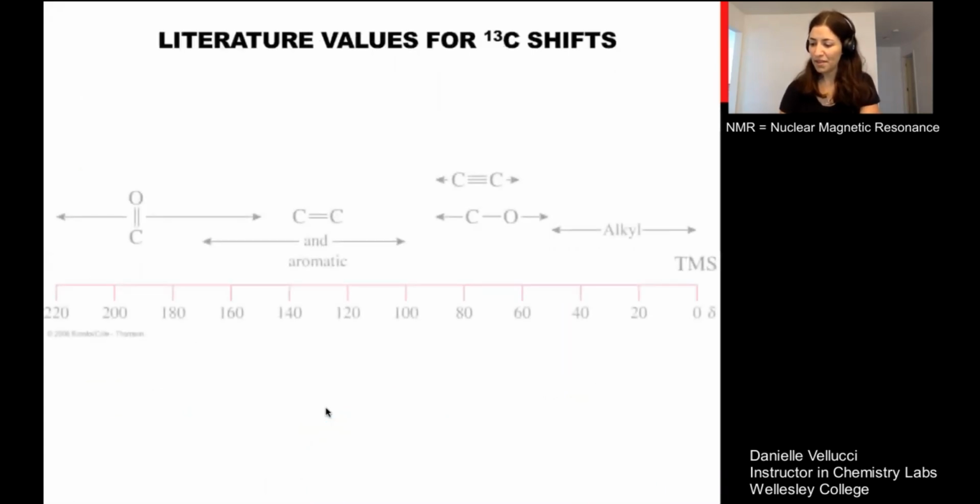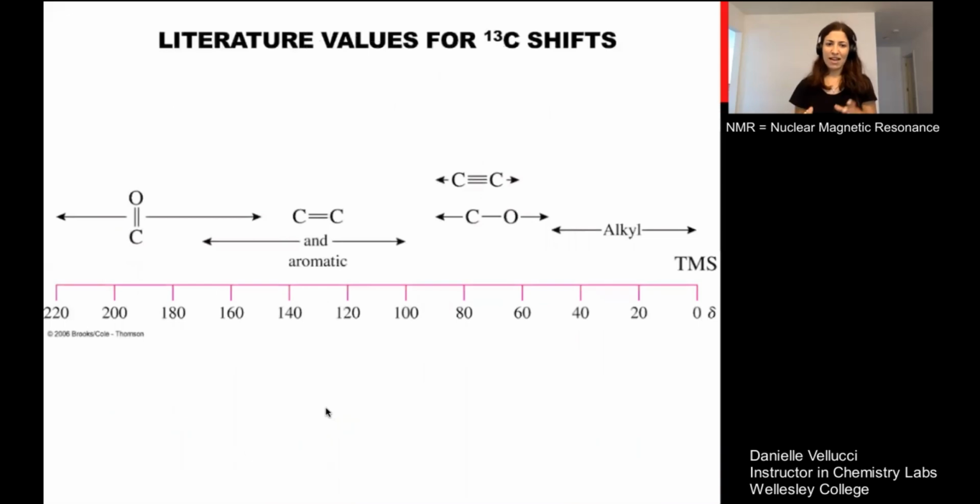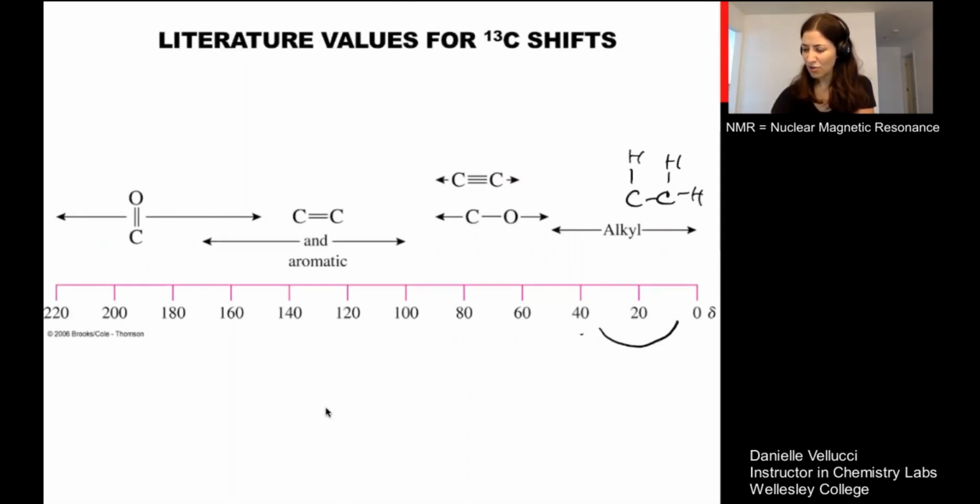Okay. So again, to sort of recap, in a very vague and quick sense, when we have CHs like in propane and butane, we tend to see the carbons here in this 0 to 25 region. As we bind to more electronegative atoms, we tend to see our signals show up more in the 60 region, or the 40 to 50 region for a carbon-nitrogen bond.